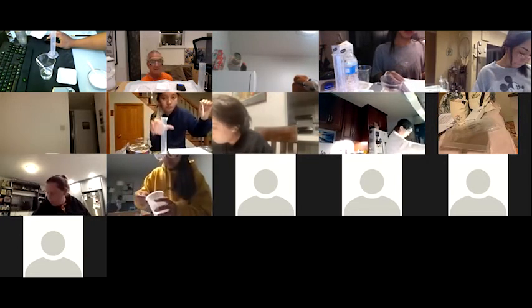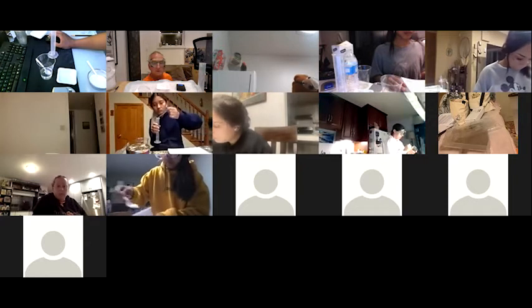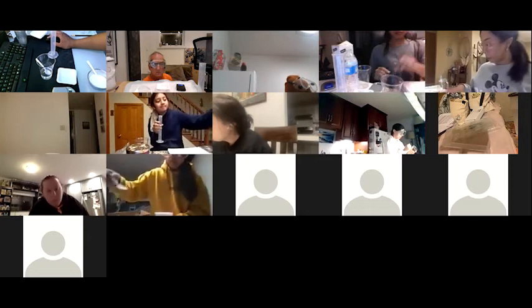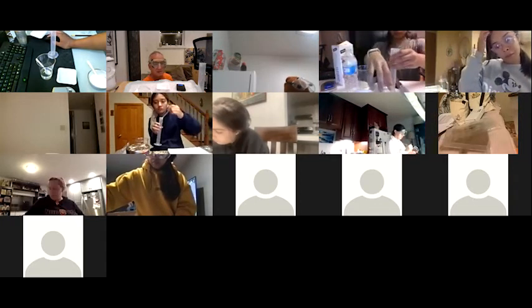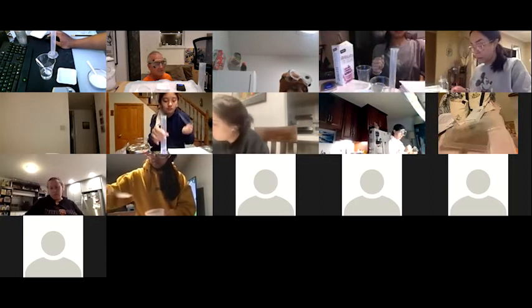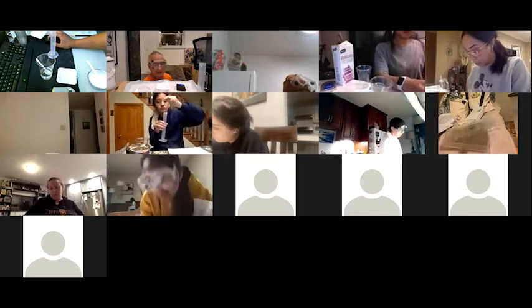I wasn't sure if during this experiment you wanted us to all have the same exact numbers. Same exact numbers of what? Like for example, the volume of the water, and then calculating the mass. Well, those should be close to each other. Some people won't have exactly 5.5; they'll have 5.6 grams, other people 5.49 grams. You're not going to have exactly the same masses.